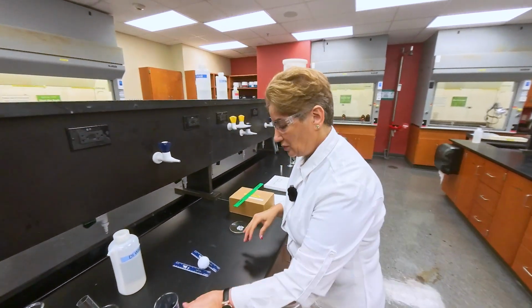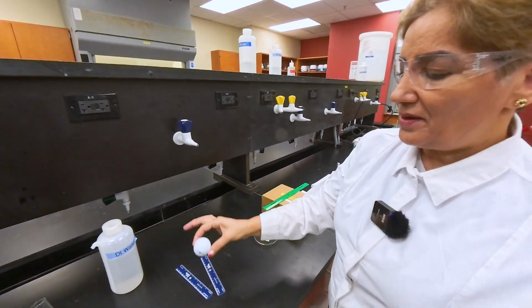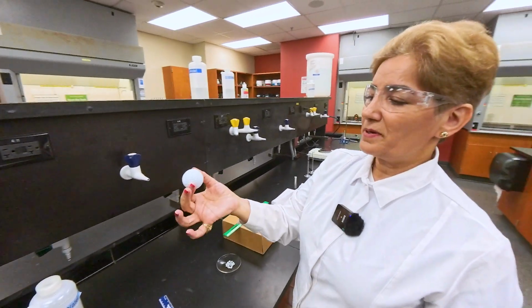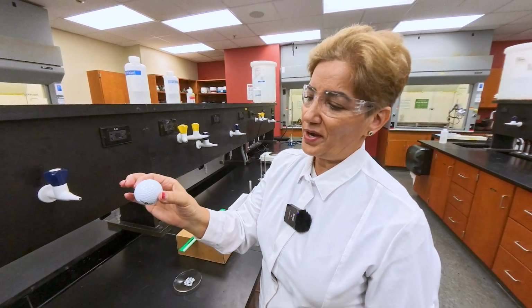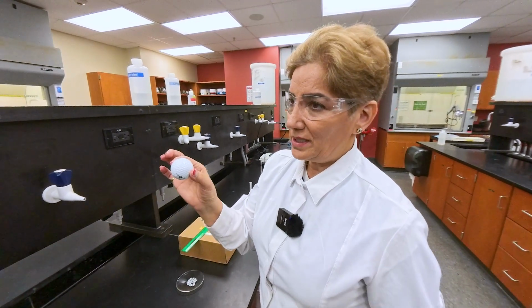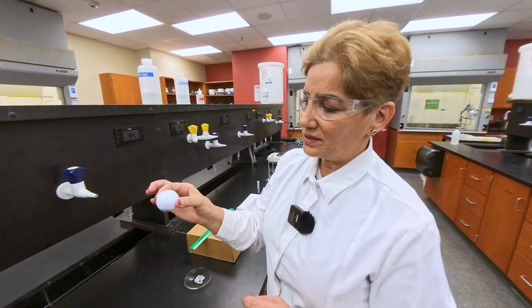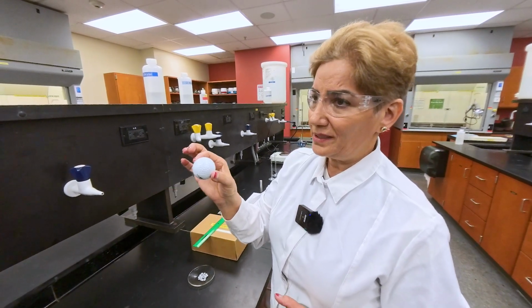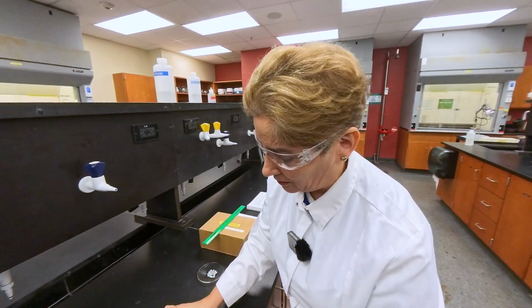Next, we are going to measure the volume of a golf ball. If it's a golf ball or a ping pong ball, we assume it is a perfect sphere. In order to measure the volume, we do need the diameter to calculate the radius, and the formula for how to calculate it is given in the lab manual. That's why you need to read the lab manual.